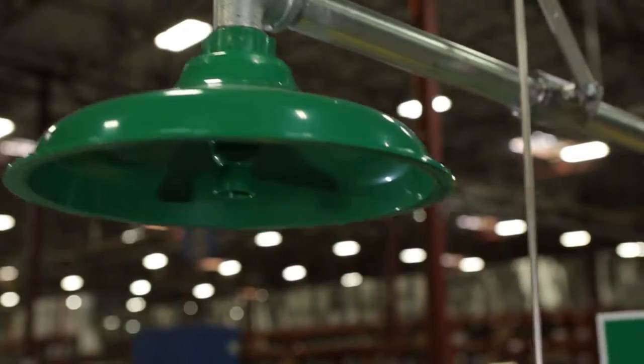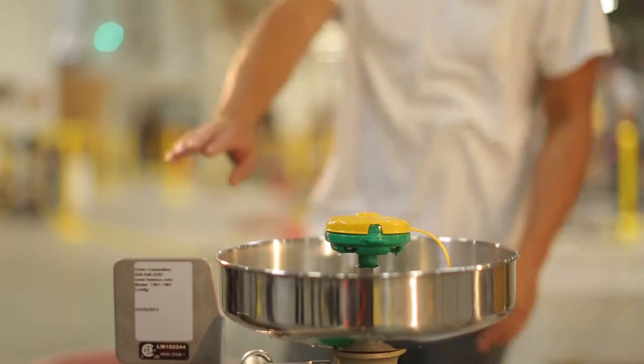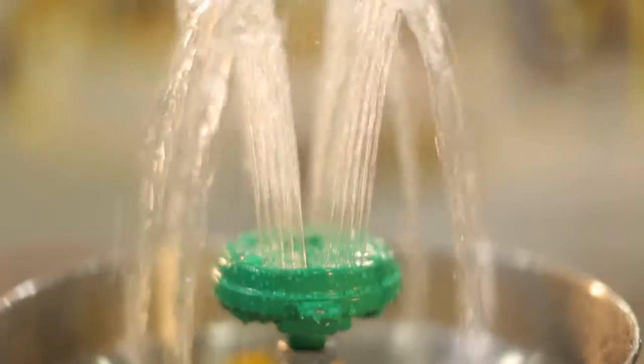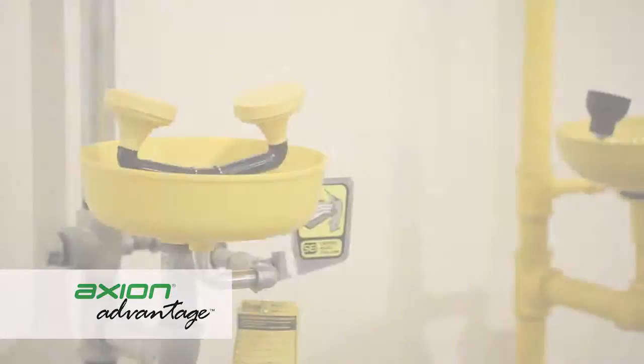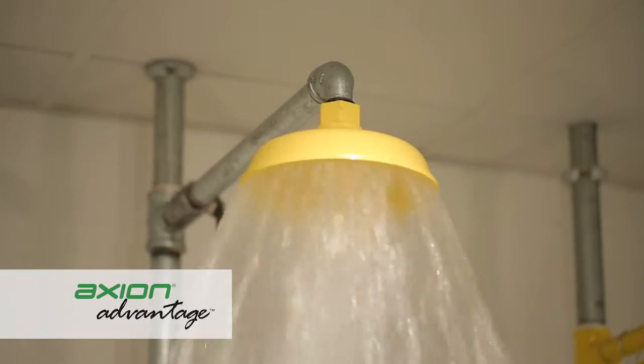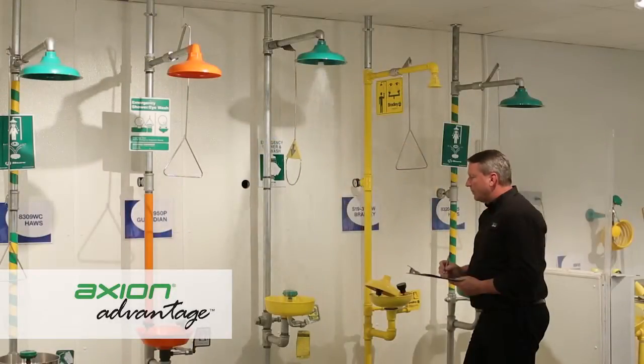These systems will not only allow customers to change out older Haas products to newer superior products, but will also change out many competitive products in the field today. In this video, we are going to demonstrate how easy it is to convert your existing emergency equipment to the medically superior response with our Axion Advantage system.